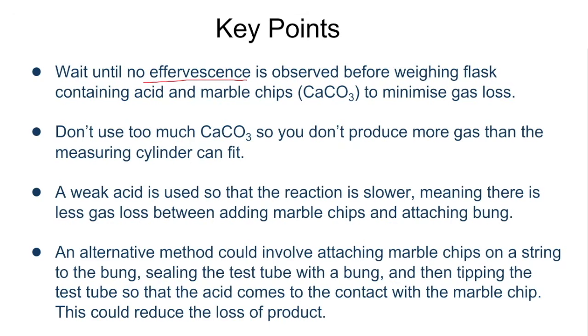before we make any weighing, reweighing any of the flask and the marble chips, because we want to make sure that we're minimising any gas loss and we want to make sure the reaction is fully complete. We don't want to use too much calcium carbonate because we don't want to make any more gas than our measuring cylinder or our gas syringe can fit.